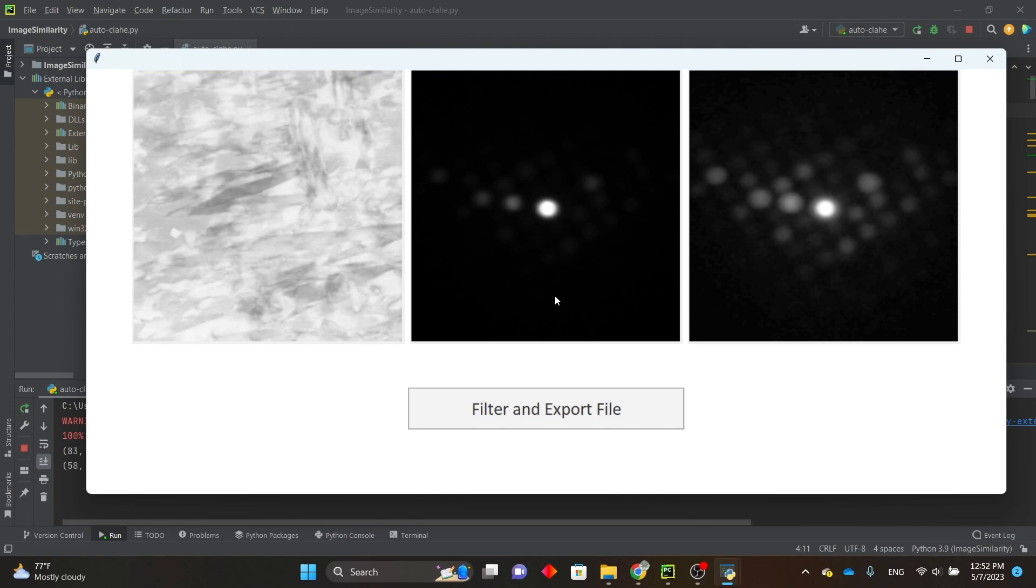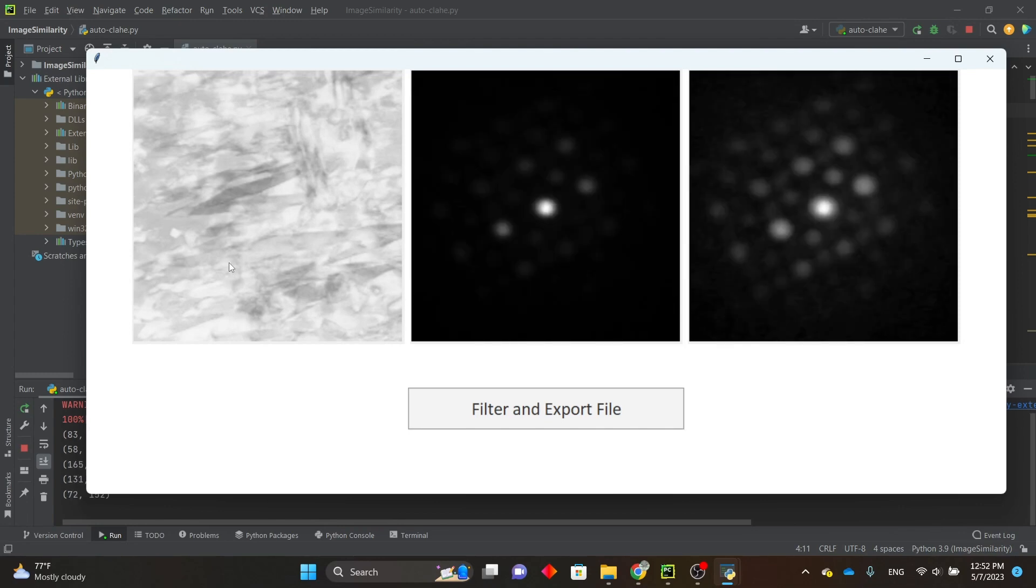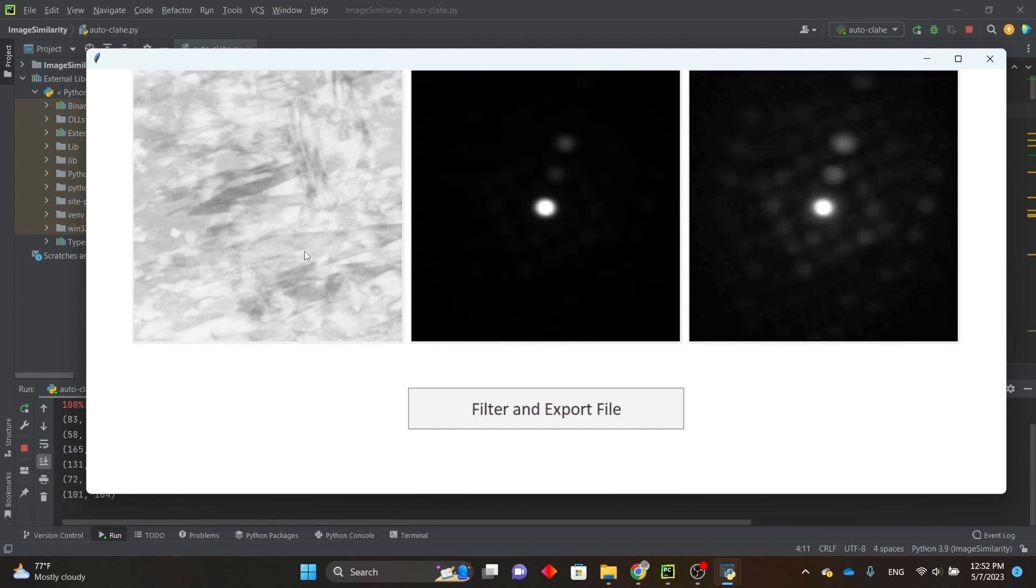In the center, you have the unfiltered diffraction pattern, and on the right is the diffraction pattern filtered with AutoClicky. You can click around to see the filtering results on different parts of the data set.